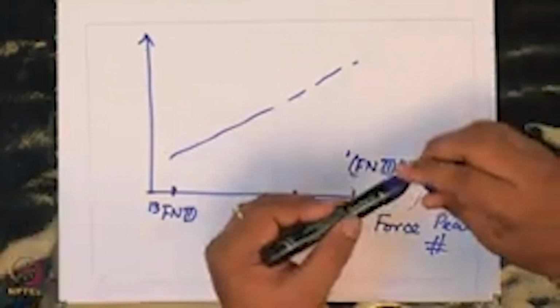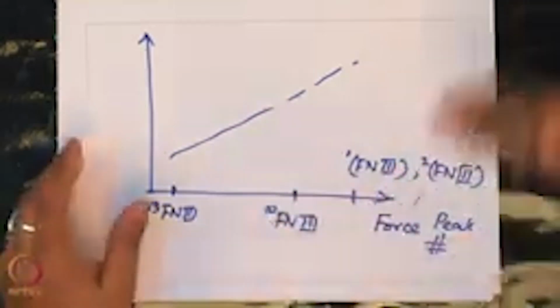Okay. So, these are among the highest forces. So, what you see is a great increase in the amount of unfolding force, and forces regulate the downstream signaling cascade as well as the effective elasticity of the protein.